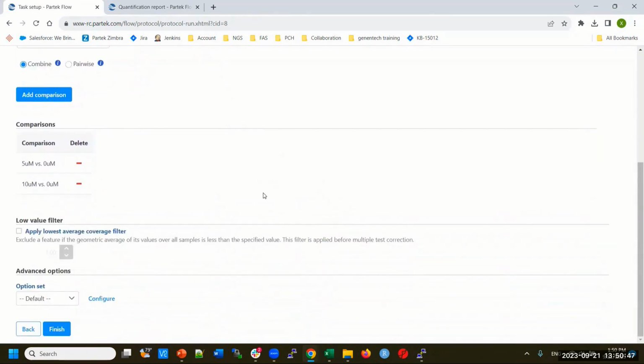If you did not perform a filter feature, by default, we try to catch some low expression genes. By default, this probably is checked. We try to filter out some genes, but you can choose to uncheck that. If you already performed a filter task, by default, we don't perform a filter on the genes again.